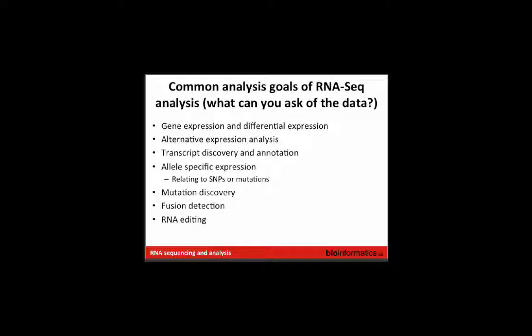So, I just mentioned this concept of analysis application. There are a lot of applications that people use RNA-seq data for, and to some degree it affects the amount of data you would want to produce and how good the quality of the data needs to be. Some of these that we're going to talk about in some detail are gene expression and differential gene expression, alternative splicing analysis, transcript discovery and genome annotation. And then there are a lot of other applications that we would love to have time to go through, but we would need a 5 or 7 day workshop. These include but are not limited to allele-specific expression, mutation discovery, fusion detection, RNA editing, viral detection, and quite a slew of others as well.